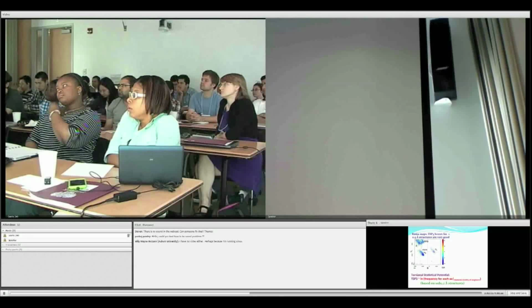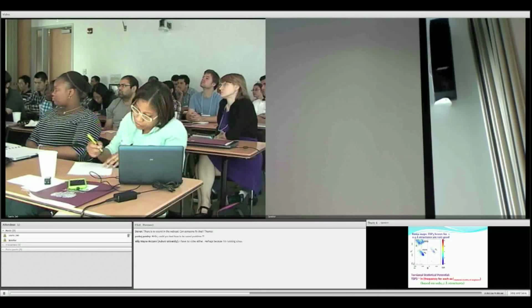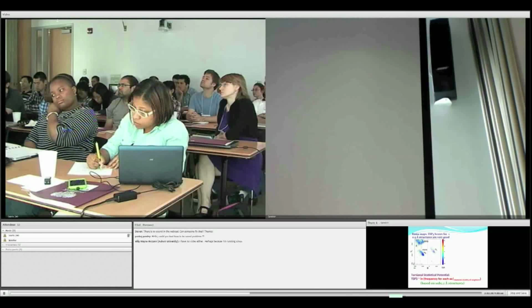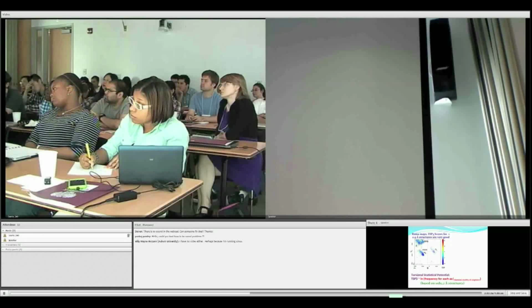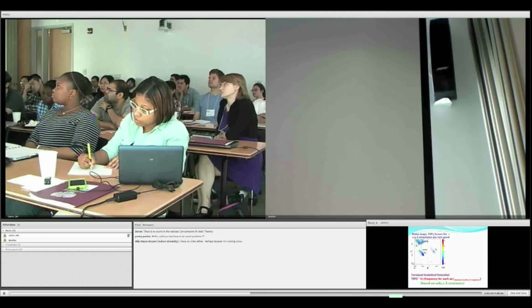Based on these triplets, we have defined a torsional statistical potential, which, in simple-minded terms, is a logarithm of the frequency of each amino acid based on the chemical identity of the neighbors, and this is done for the resolutions below 2.2 angstrom. So this would be a statistical potential that we have defined using these triplets.